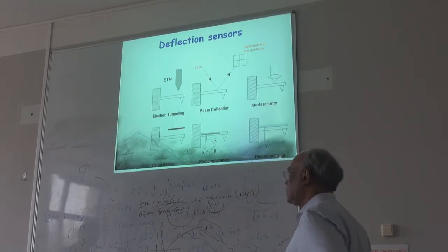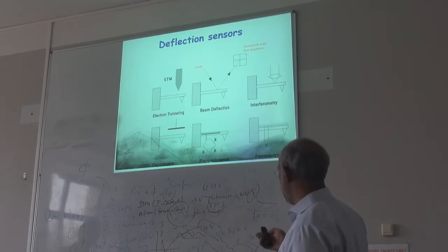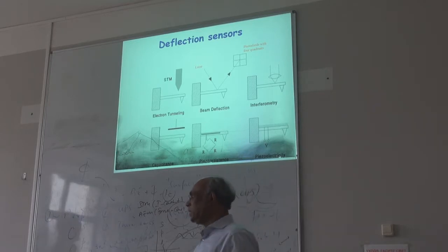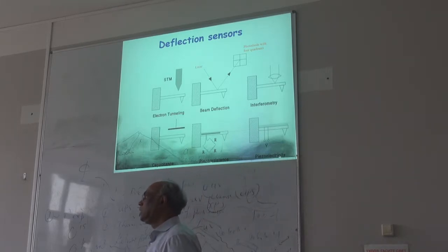And you use these methods in your research? No, we only use the commercial AFM using this technique. For nanomaterials? Yes. The thing is, we are looking at this phosphorene. That's a two-dimensional material. You can see it easily from AFM. And you can see atoms? No. So with AFM you cannot see atoms. You can only see the features.